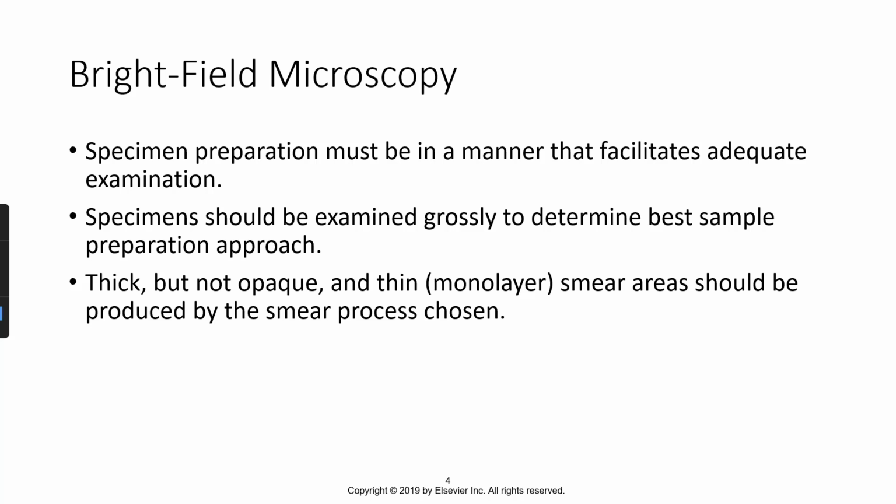So it goes up from the bottom through the specimen into those objectives where it's magnified initially, and then through the oculars where it's magnified a second time, and then eventually into the eye.